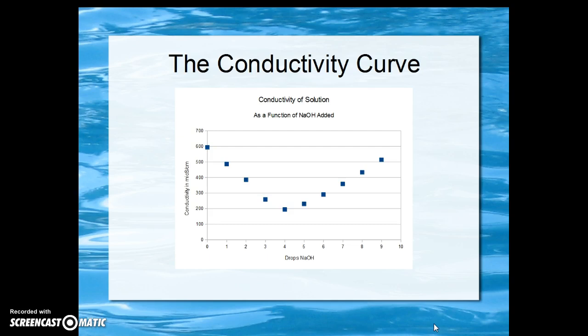This is the conductivity curve that results. As drops of sodium hydroxide are added to the hydrochloric acid, the conductivity gradually and linearly goes down.